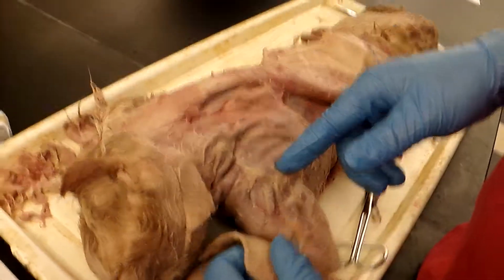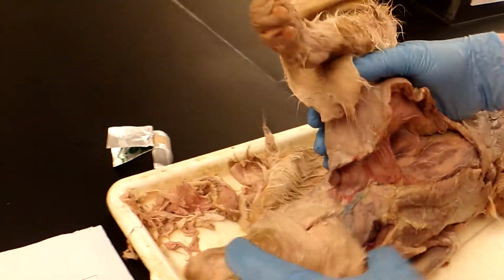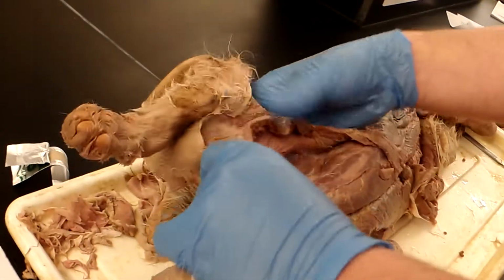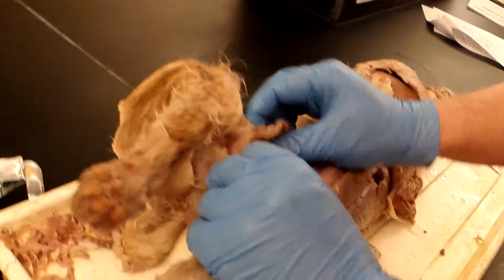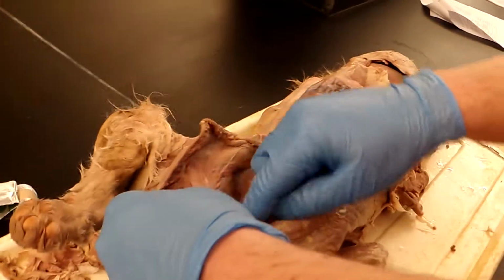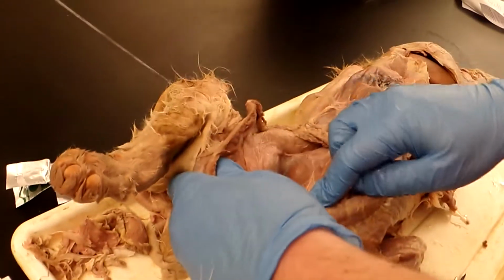Oh, there it is. So it's located on the other side of the cat. It is located right down here. Yeah, it'd be right up here.